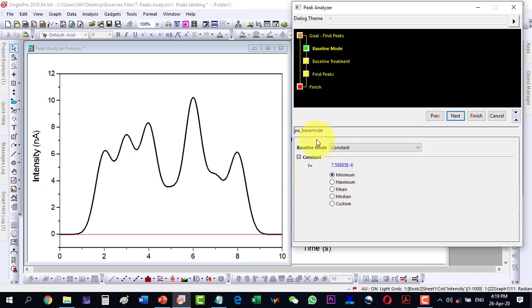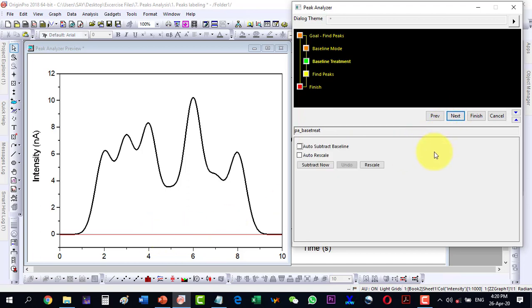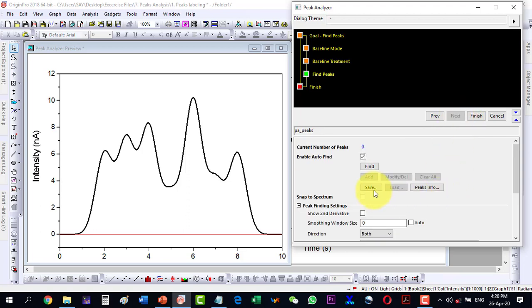Here we go to the option Find Peaks and click next. It asks what the baseline mode should be, so we select baseline mode as constant — this is the red line shown here. We click next, and it says subtract the baseline, so we leave that as it is and click next again to reach the auto-find peaks section.